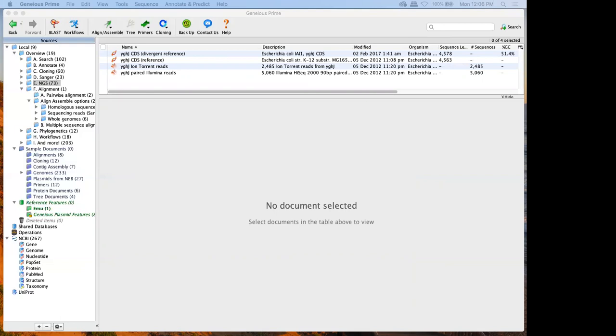Now, Geneious can do the pre-processing, so I can bring in data straight from a FASTQ file. It can do the pre-processing of my data, map it to a reference sequence or do de novo assembly, and then it can call my SNPs. That being said, you can jump into that pipeline or process at any point.